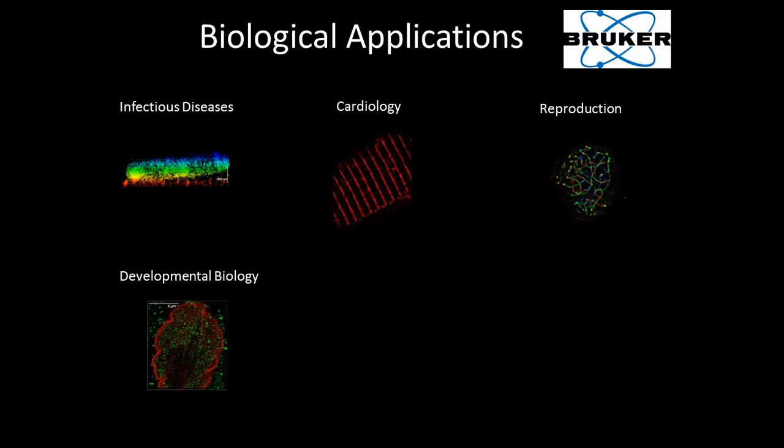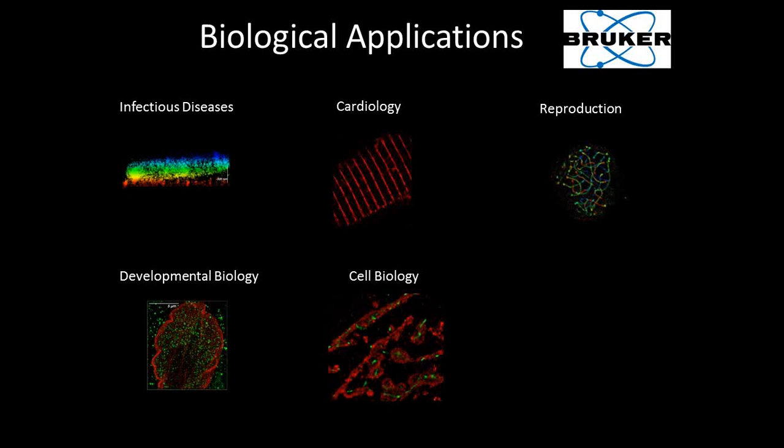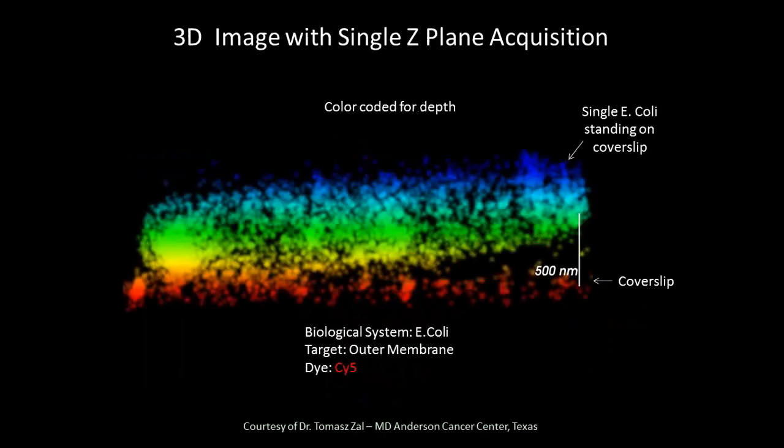Looking at imaging thicker samples like Drosophila, and how would you be able to optimize it for that? Just looking at basic cell biology functions such as imaging Golgi or the nucleus or mitochondria. Mitochondria tend to be a very popular model system to image, and one of the other popular science fields to look at is actually neuroscience.